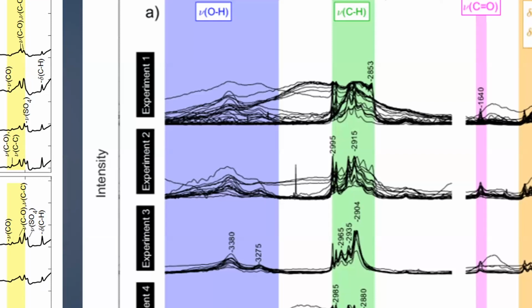And so we were able to start to understand what these were consisting of. These on the left here are all averages of quite a number of spectra, but I wanted to show you on the right here some of the different individual spectra for the particles that are in the upper left here. One of the things I wanted to make a point of is that you actually get quite a bit of good reproducibility. There's the occasional outlier, but a lot of these peaks are very reproducible.